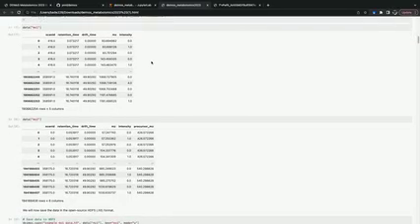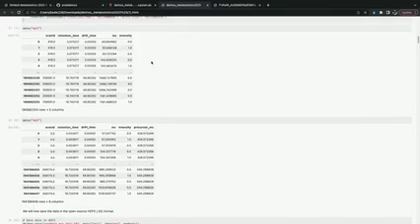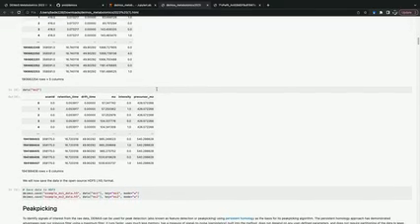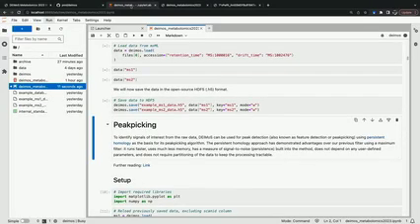Yeah, so while the notebook is running, we'll just show what the output should look like. Essentially, you can see the data will load into a pandas data frame, and so you can read the data in tabular format, and you can see there are quite a many rows. So that's what's taking the notebook a while. I think it's still going.